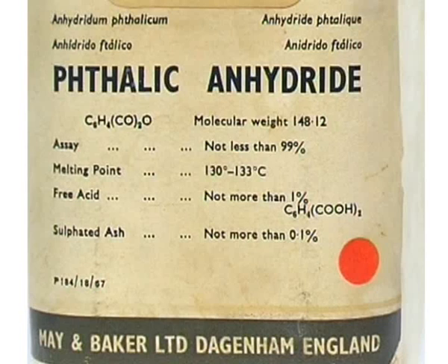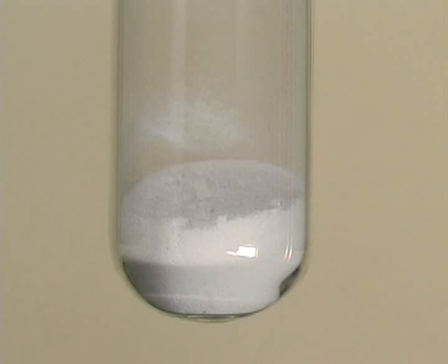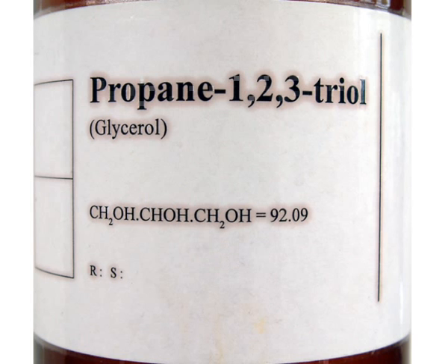Three grams of benzene-1,2-dicarboxylic anhydride, formerly known as phthalic anhydride, was weighed out and added to a test tube. Two cubic centimetres of propane-1,2,3-triol was added.